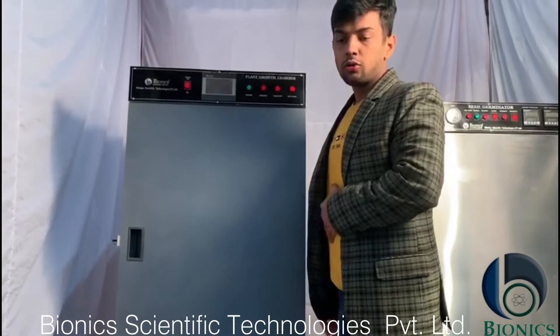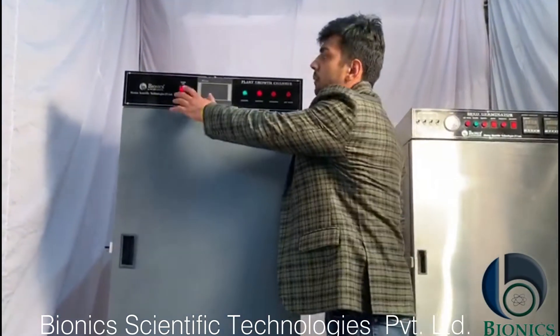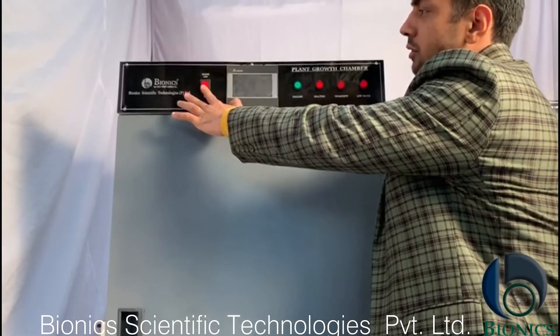Now I will tell you how this machine works or how you can operate it. This is your mains button. First you will switch on your machine like this.